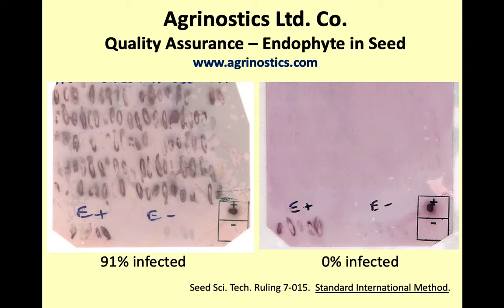So here's a seed right here. Here's a seed right here, and the color reaction mimics the shape of the seed. So we can detect this right here, for example, is a seed lot that tested 91% infected. Here's a seed lot over here that tested 0% infected.